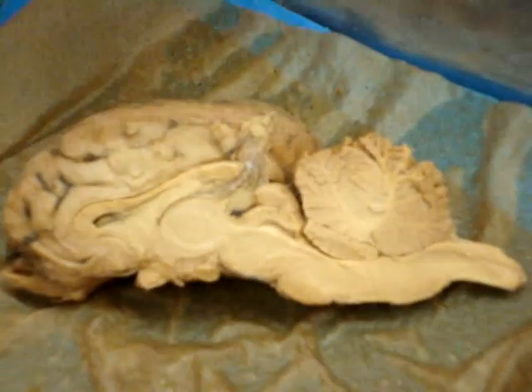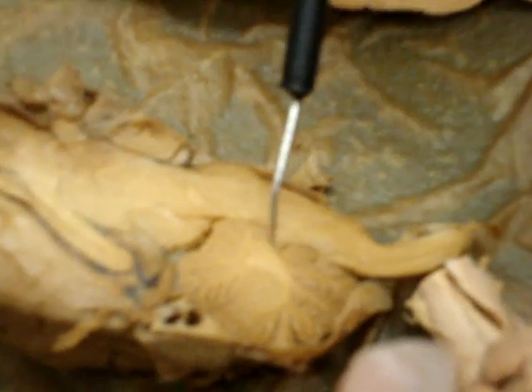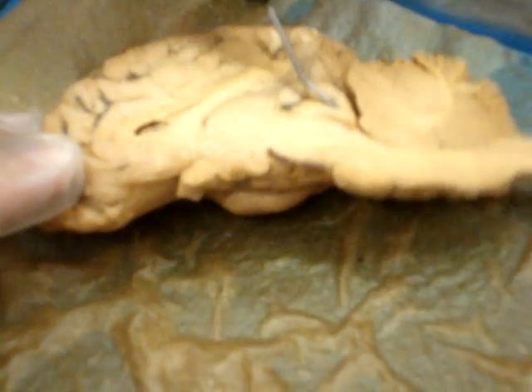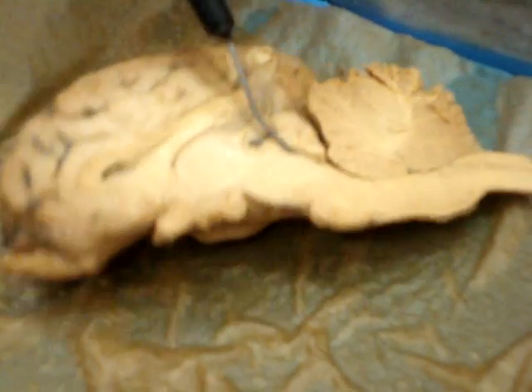Okay. There's a hole right here. Lateral ventricle. There's a white C-shaped thing on top of it. Corpus callosum. There's a hole right there. Fourth ventricle. Would you pull that fourth ventricle back? There's a tube. You can't really see it on there. It's obvious on here. Right where the tip of the probe is, there's a tube. What is it? Cerebral aqueduct.